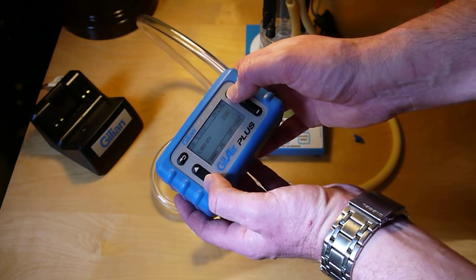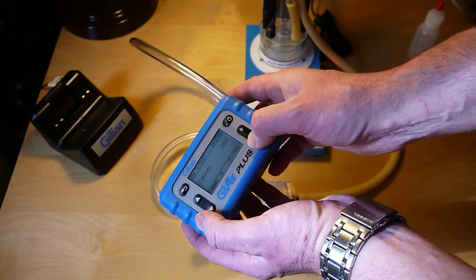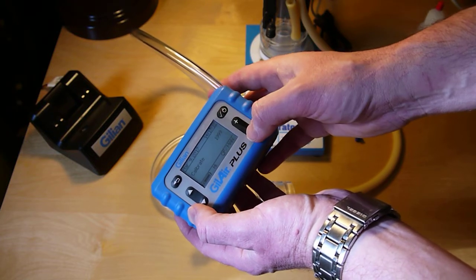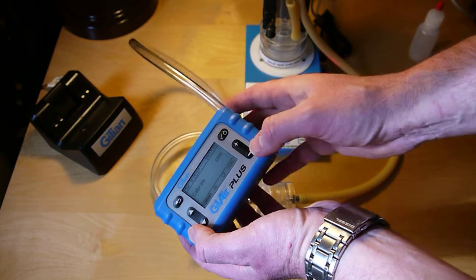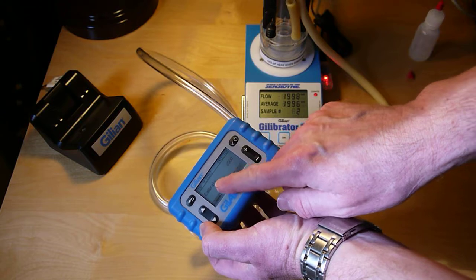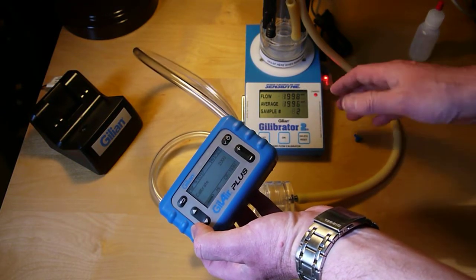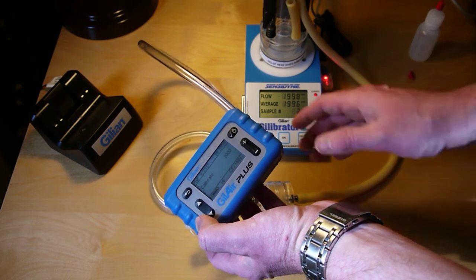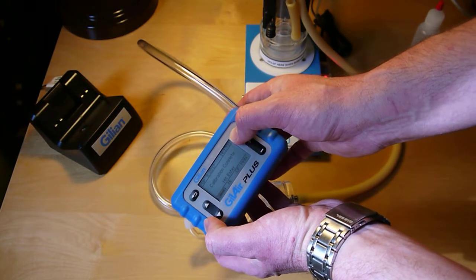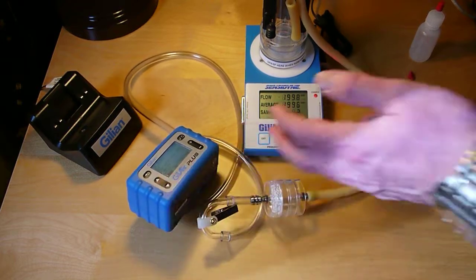So I go into calibrate. It's pretty much right on, but what I would do would be adjust this to whatever value it is and hit enter, and then it would readjust the flow rate. You basically want this reading to match this flow here within about 1%. Once you're done, it just says calibration complete. Hit enter and then I'm ready to connect this up and put it on someone for sampling.